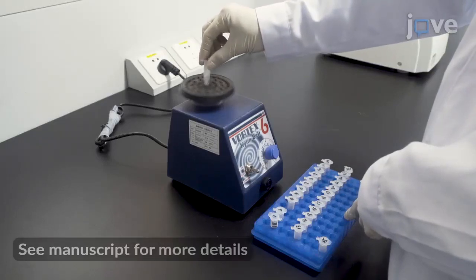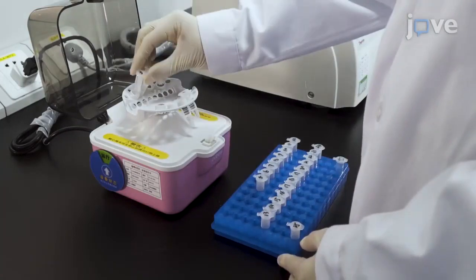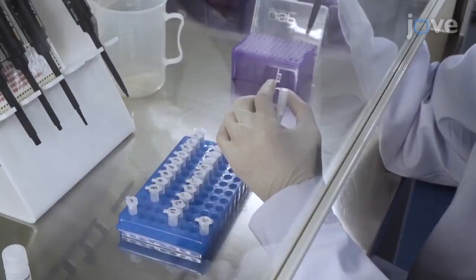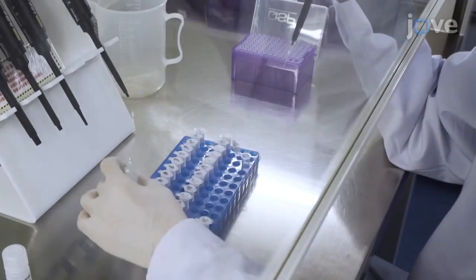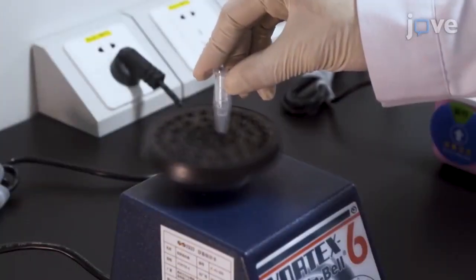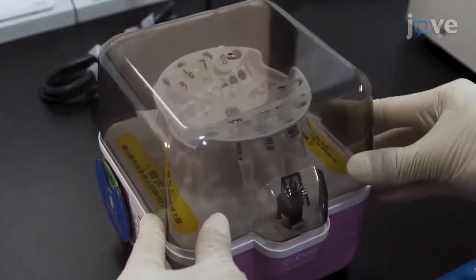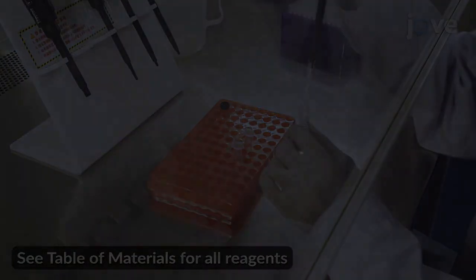To begin sequencing, vortex each diluted library and briefly spin four times on a mini-centrifuge for three seconds each time. Then take five microliters of each library to pool into the nuclease-free 1.5 milliliter tube. Vortex the mixed library and briefly spin on a mini-centrifuge for three seconds. Add 150 microliters of the braking solution to two new recovery tubes.